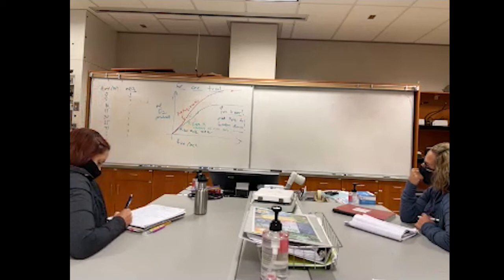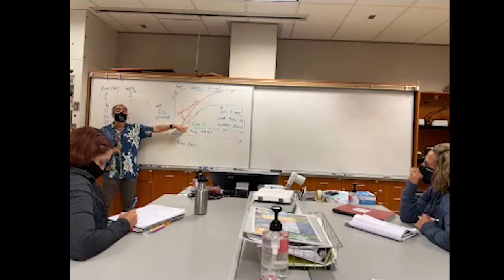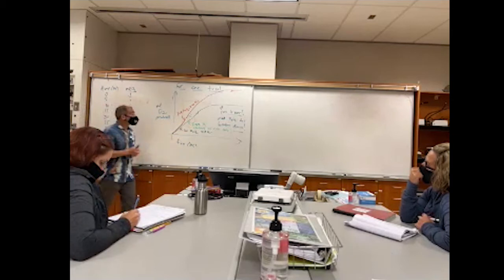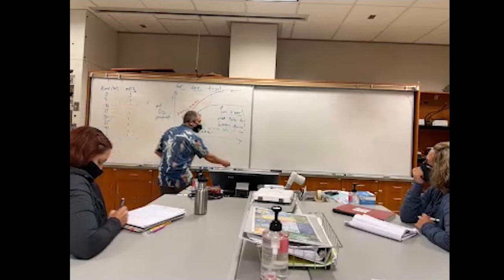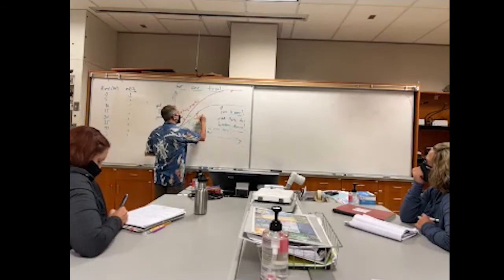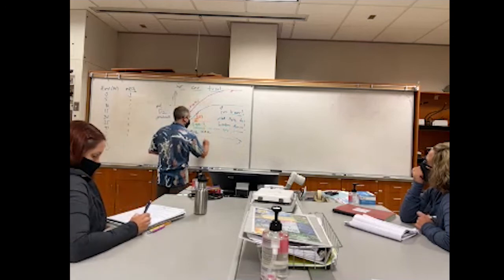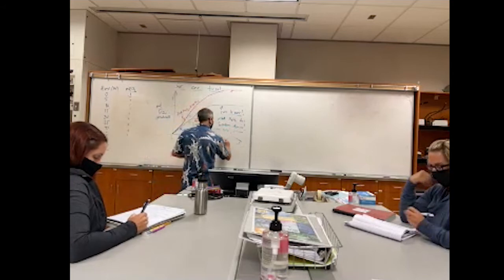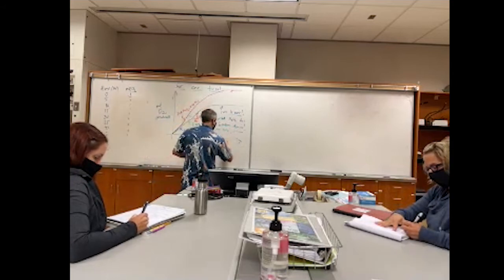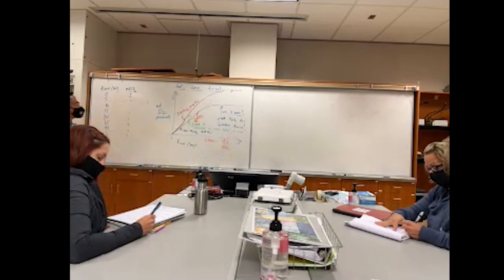That's why I don't want to spend all our time today going into the mechanics of calculating that slope right now, because I want to make sure we get through all the data collection. But it's just basic math. You go on your graph, you just calculate delta y over delta x. That's all the slope is. Slope is rise over run, change in height over the change in the x-axis.